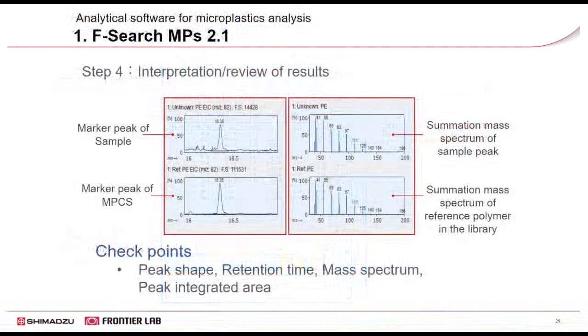As you know, with each interpretation library and software, the results must be reviewed and confirmed. So at your last step, you want to check for the peak shape, retention time, mass spectrum, and peak integration area of each polymer listed in your search result.